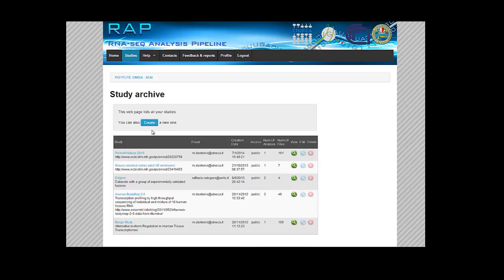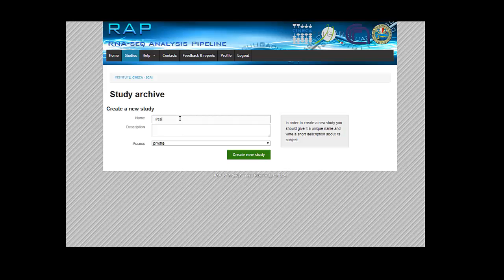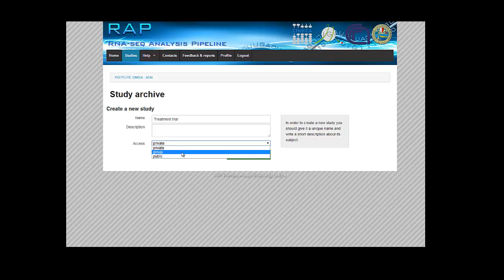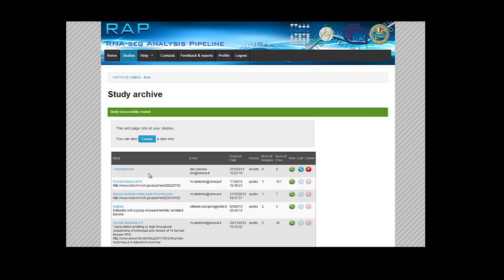But let's create a new project. We can make this project private just for ourselves, for our group, or totally accessible for every user on the pipeline. Okay.